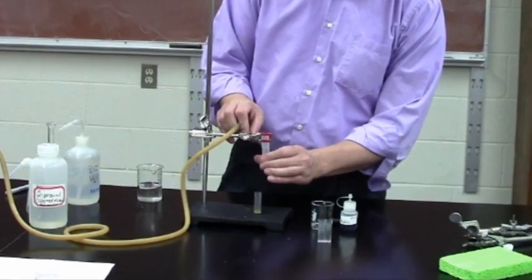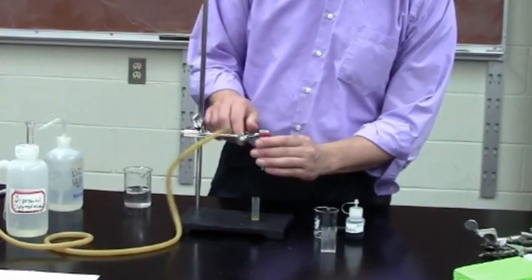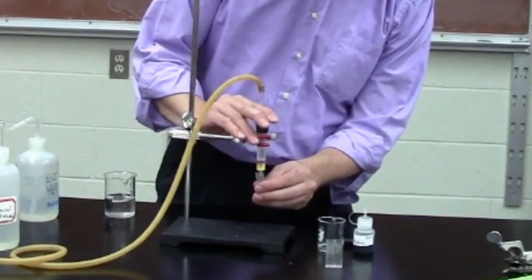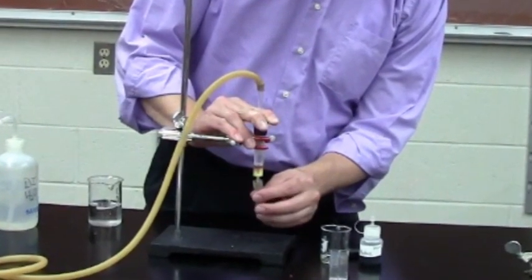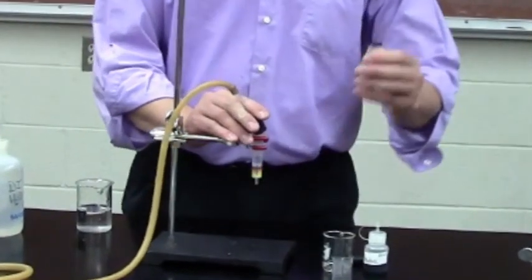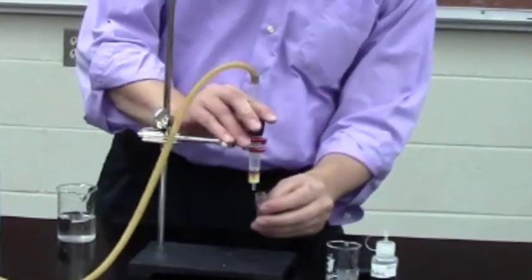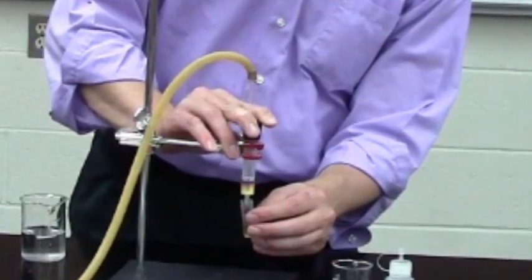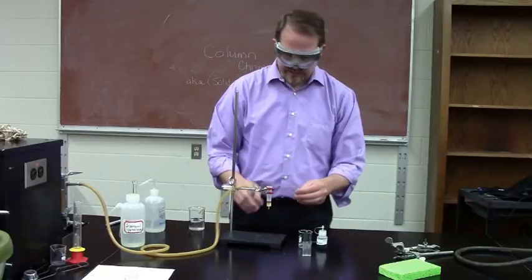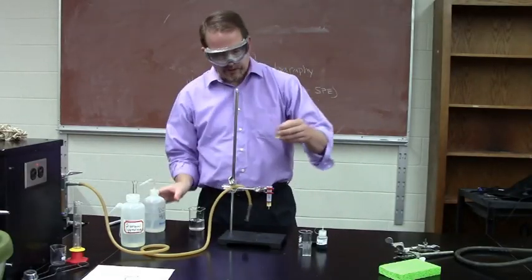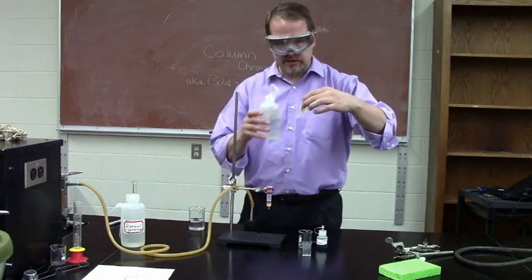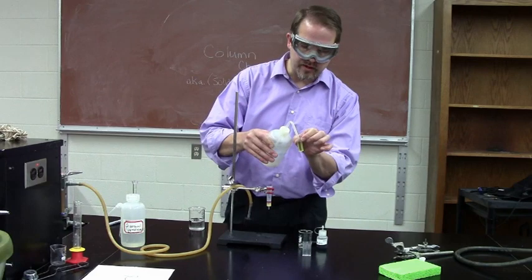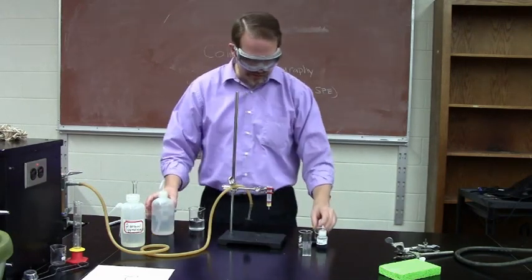The main thing here is we want to collect the color. Now, if you don't quite fill up the cuvette, don't worry. We can add more water to it to get it to the proper level. The main thing is purity to get just the yellow off. And that is enough to do our spectroscopy. I've got a little more yellow, so I'm going to try to push it off. That looks like I've got good yellow separation from the red and the blue in there. So I'm going to go ahead and add a little more water. And now that is ready for spectroscopy.